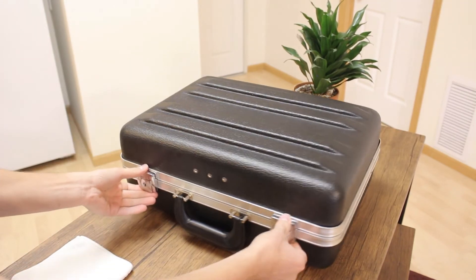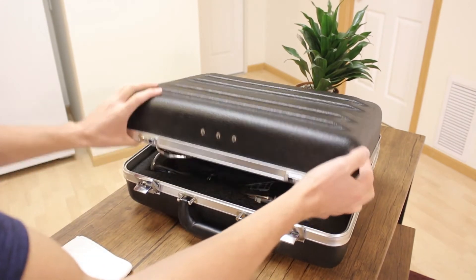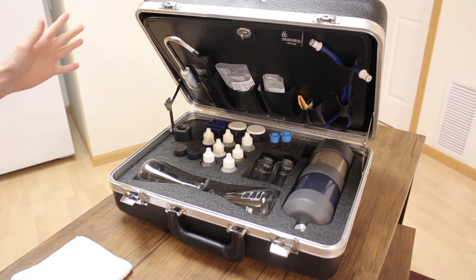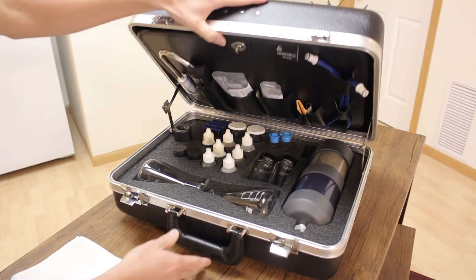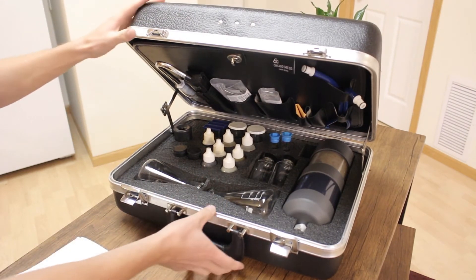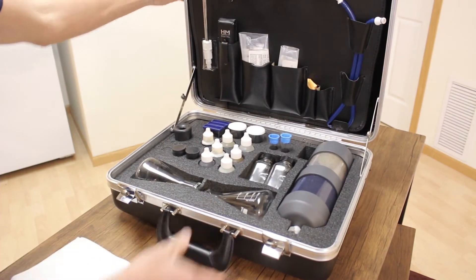At the very least I like to lock my test kit now and I don't leave it in my garage. When you do open it, the latches are really nice — they just pull up and then you can open the top. If you have a really short countertop where you don't have the ability to open the case all the way, you can open this one just halfway and then close it again, or you can open it all the way up.